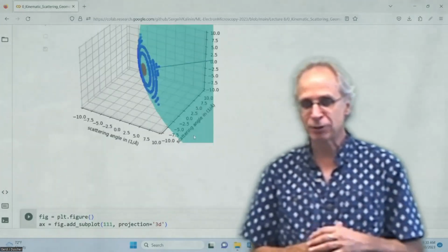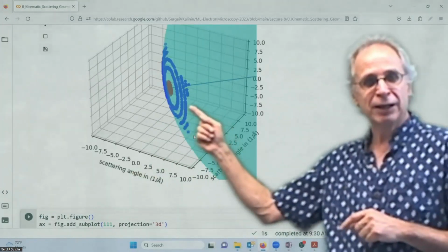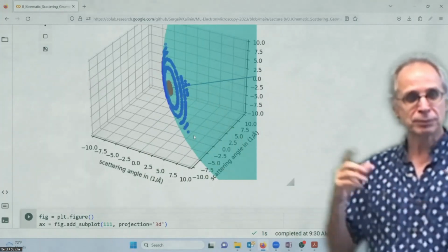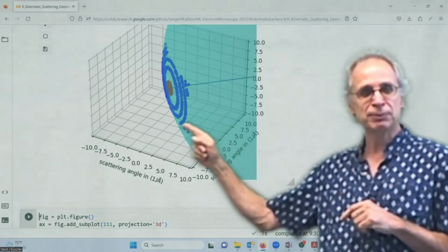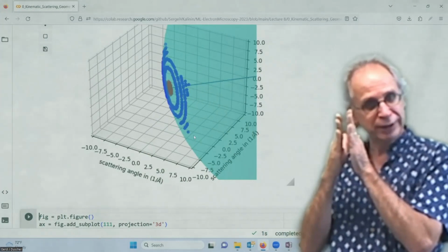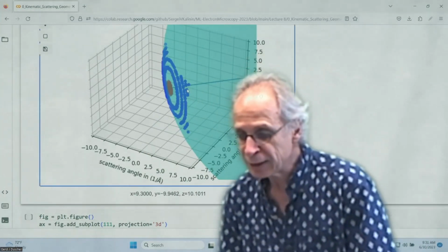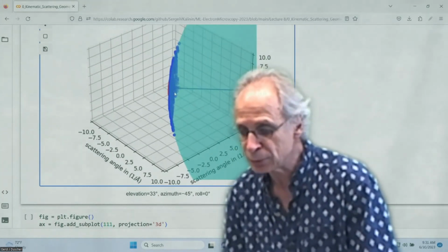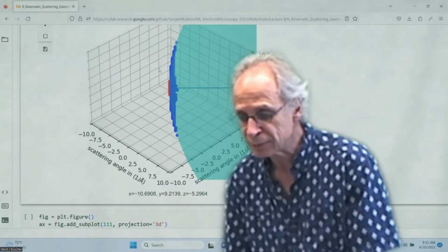Let's plot that to visualize it. We have an Ewald sphere, and now we look at all the atoms that are allowed. So they are close to the Ewald sphere within a small excitation error, positive or negative. And okay, let's see how good it works here. It was animated out here. Let's zoom in a little bit.